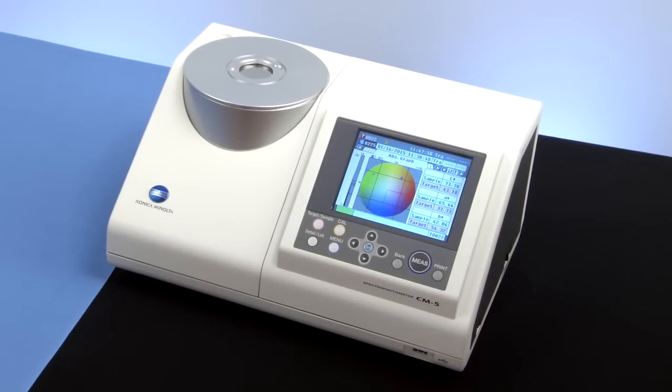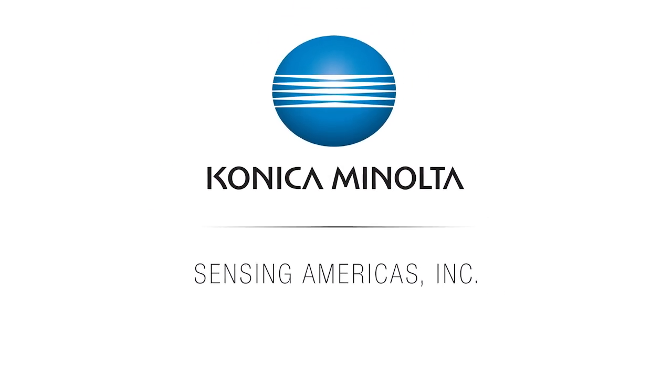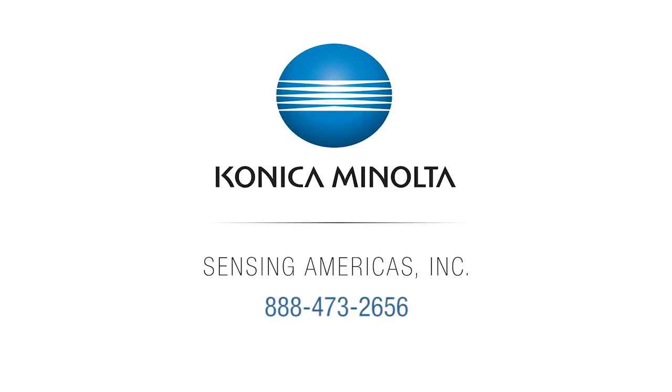Enhance your color evaluation program and easily adapt to any measurement requirement with the versatile CM5 benchtop spectrophotometer. To learn more, contact one of our color experts at 888-473-2656 or visit us online at sensing.konica-minolta.us.